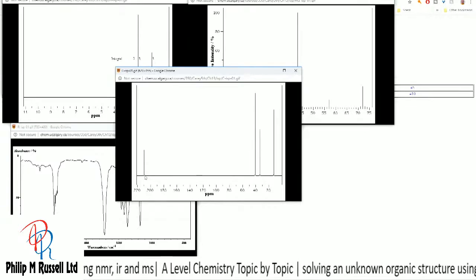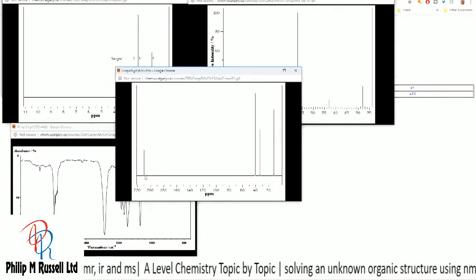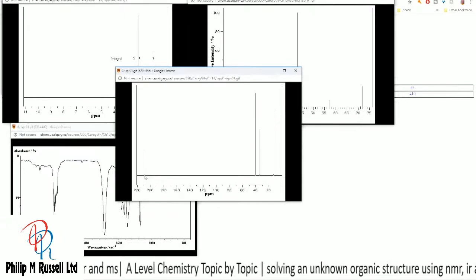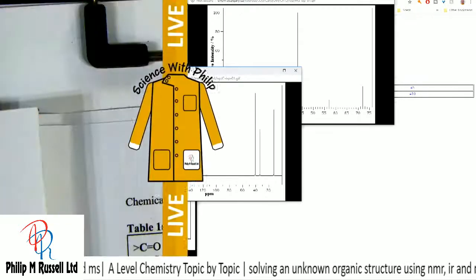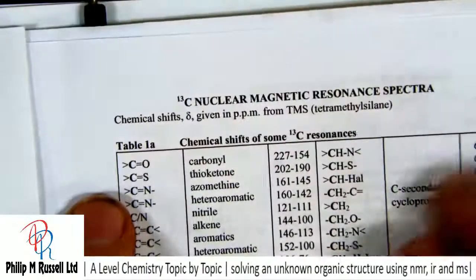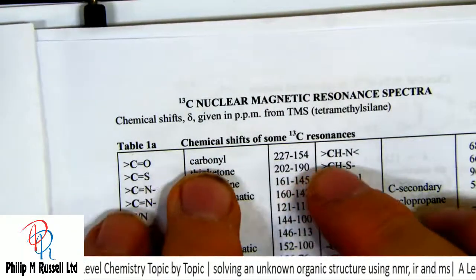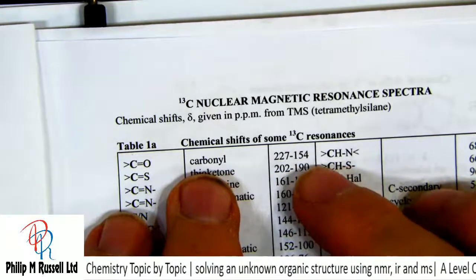That normally suggests something in the region of a carbonyl group.